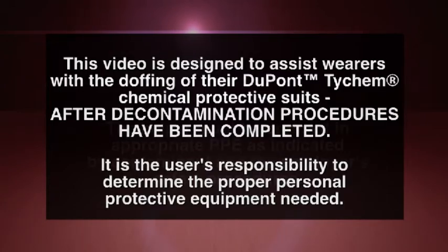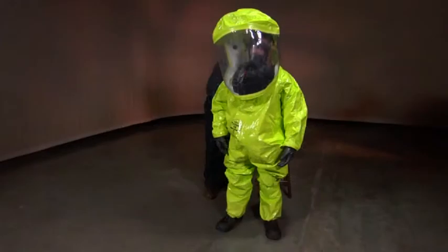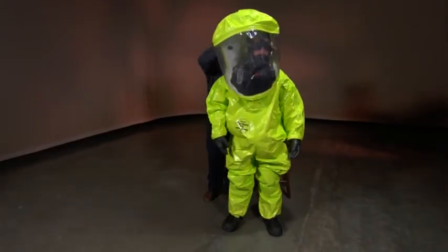In order to doff a Level A or Level B encapsulated suit, proceed as follows. A helper is needed to assist the wearer with the doffing steps.